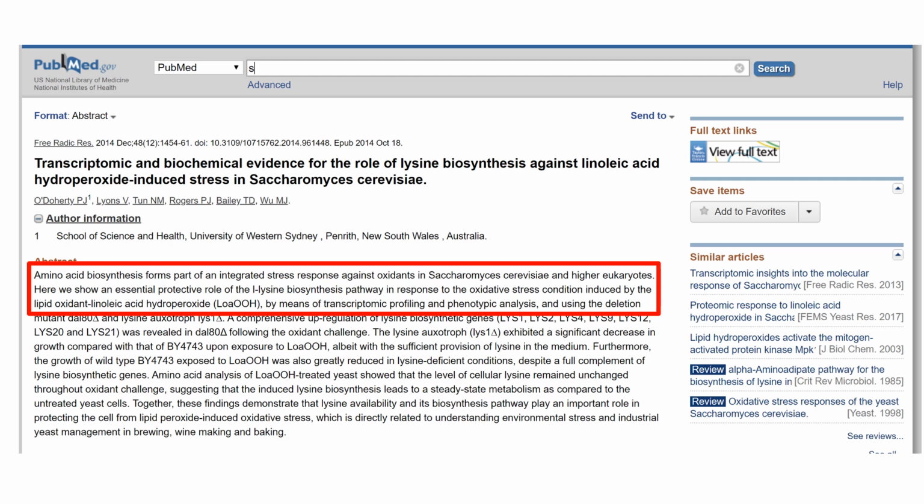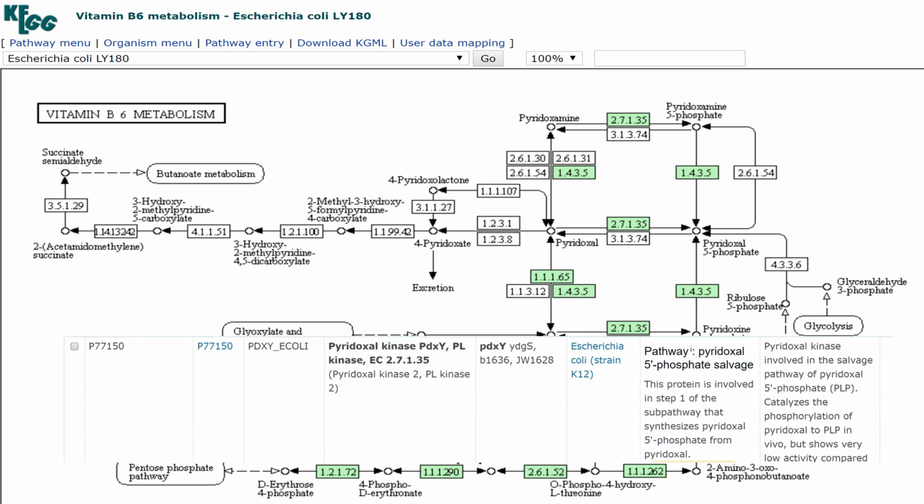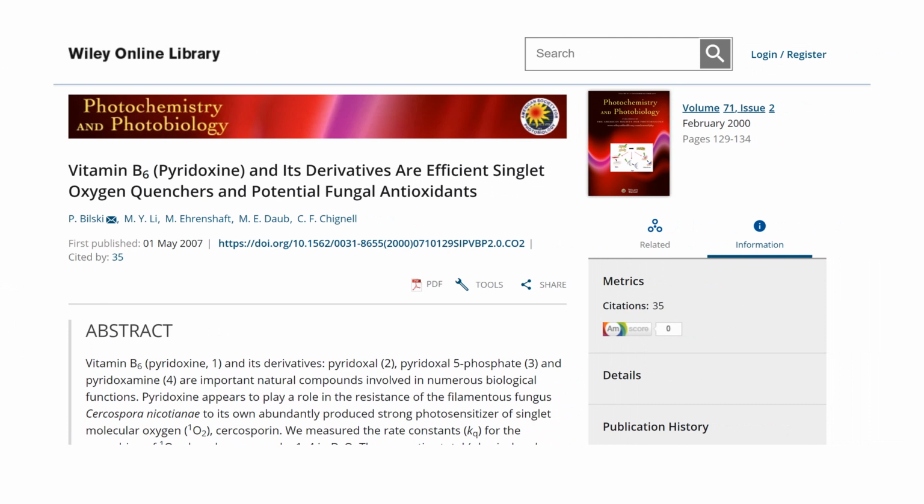of the video presentation. Another protein that was found only in the treatment group is the pyridoxal kinase. Now, this protein is involved in several different steps in the vitamin B6 metabolism pathway. Another name for vitamin B6 is pyridoxine. Sorry for that. Now, this vitamin B6 can be involved in the virulence factors of the bacteria, but also it is a really efficient quencher for singlet oxygen. Singlet oxygens are reactive oxygen species. So these are the things that cause oxidative stress.